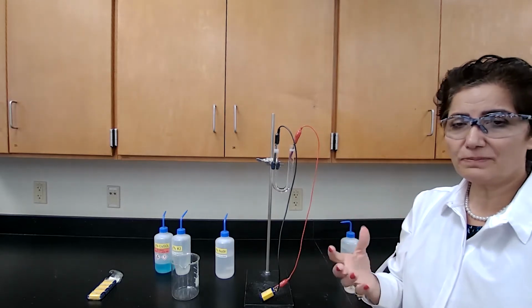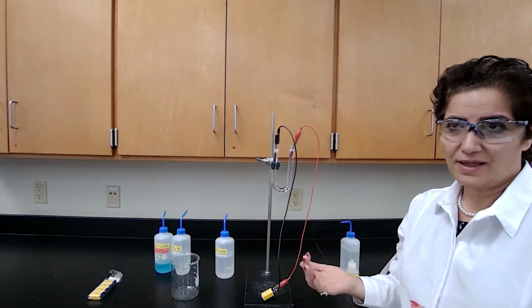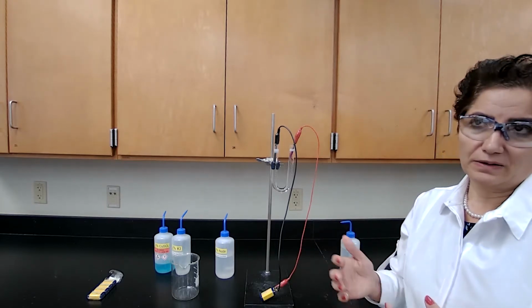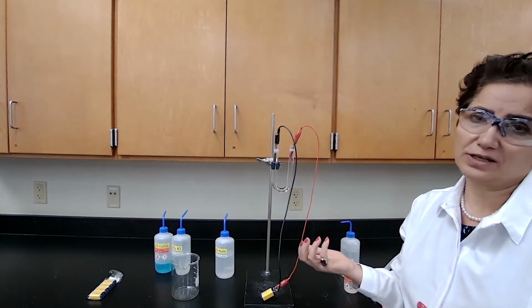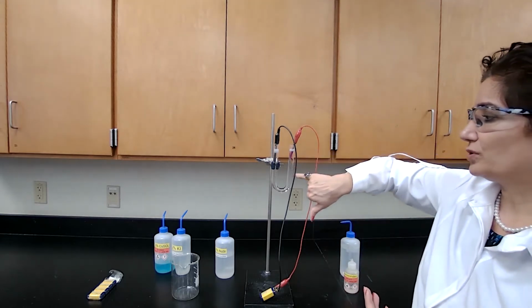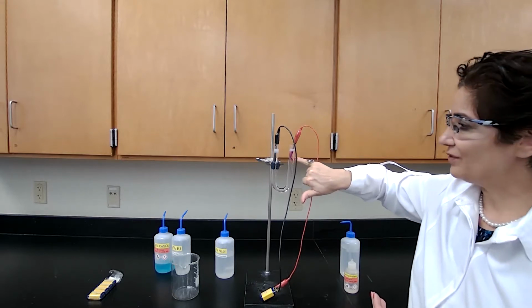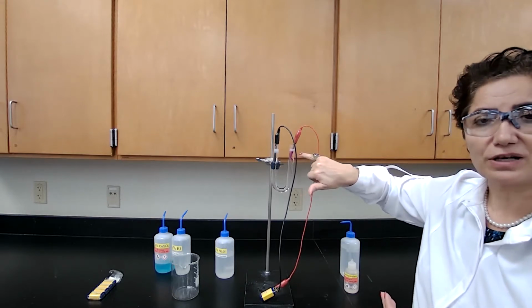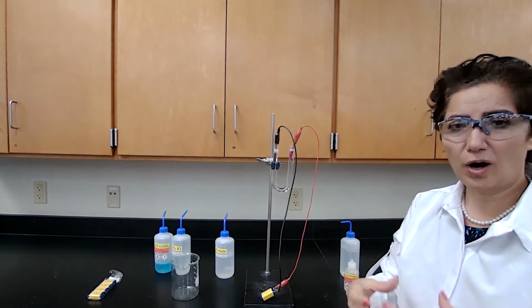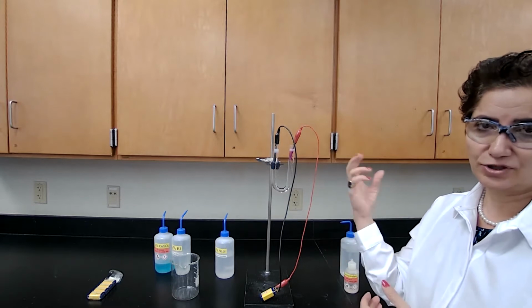Either sodium gains electrons and is reduced, which gives you sodium metal. The other option would be water being reduced, and when it's reduced, it would generate hydroxide ion. If hydroxide ion is generated, the solution would turn pink because we added phenolphthalein. So phenolphthalein indicates that hydroxide ion has been generated. That is the evidence for water being reduced.